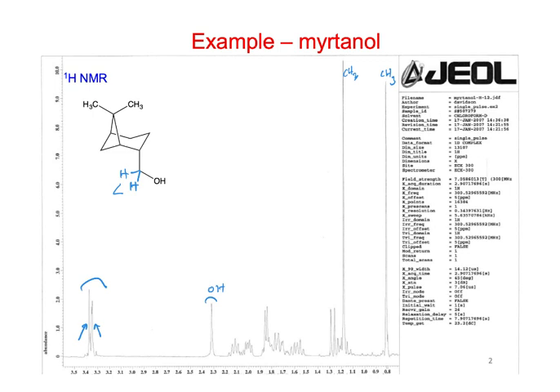Though, in the proton NMR, those methyls were really quite far apart, right? Look at this one: it's at 0.8, and that one is 1.2. They're quite different, but both of the methyls are the most upfield. We generally imply that the carbons would also be the most upfield, right?